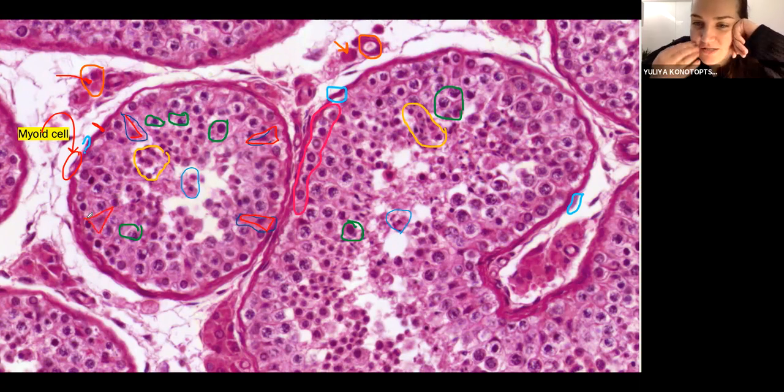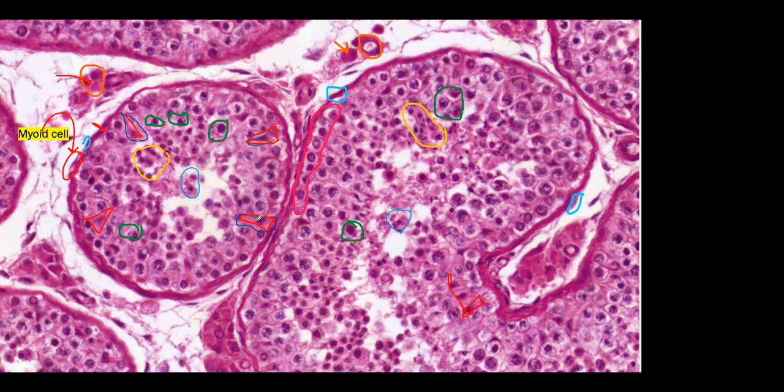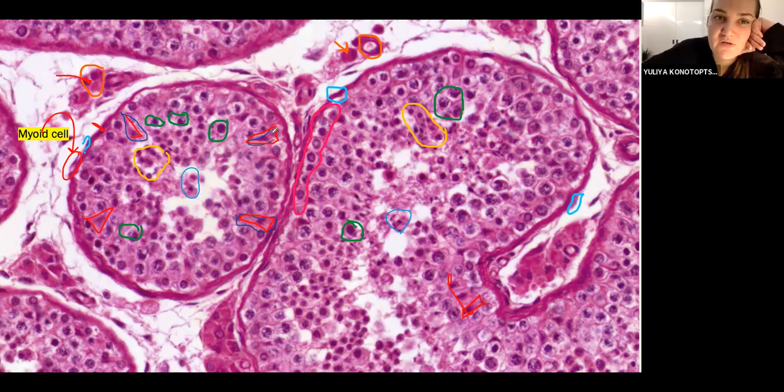So it has a bit of a triangular appearance, like these ones as well here. I'm really stretching it, but this one is perfect. This is a perfect triangular cell right here. So you can clearly see it there, right? Okay, these cells are Sertoli cells, yes. So these are the supporting or Sertoli cells.